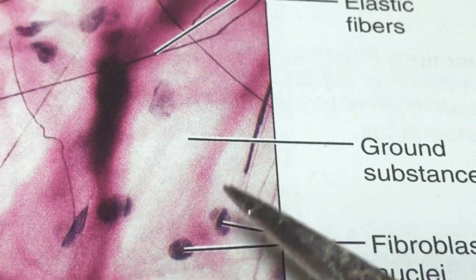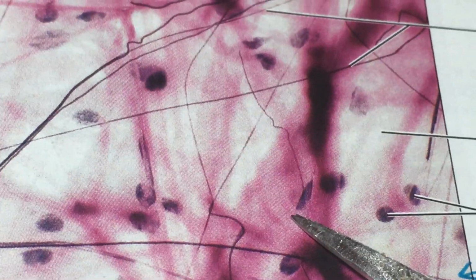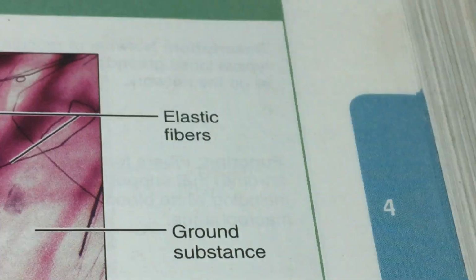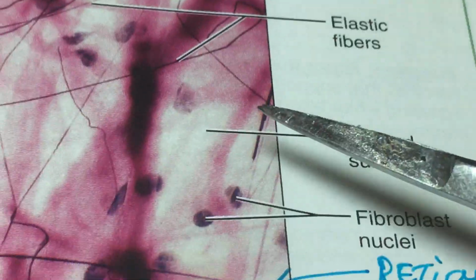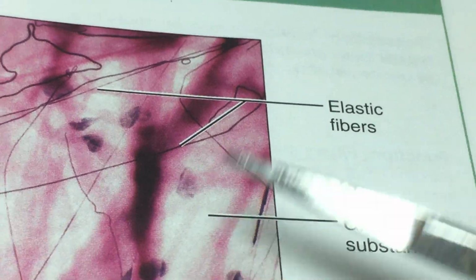Okay, so we see little more than a nucleus. We also see some other cells in here which are hard to interpret. Let's see if they make the attempt to interpret. No, they don't. Ground substance, again, they're just pointing to empty space here, which is the liquid format. Okay, so that's the idea at any rate.